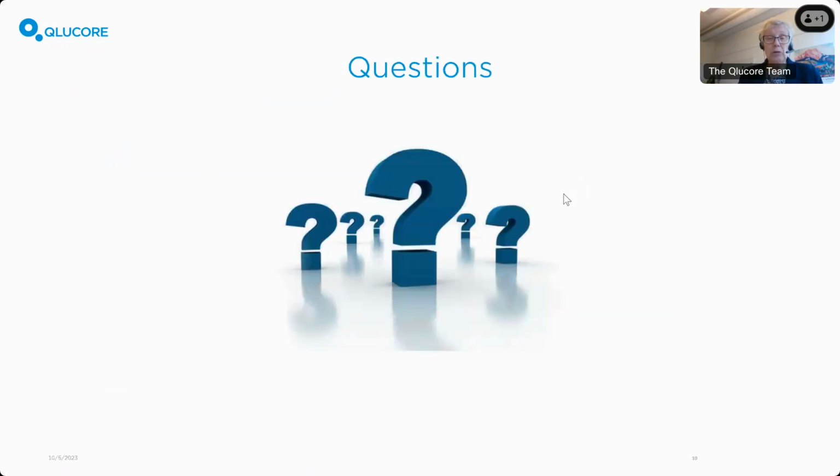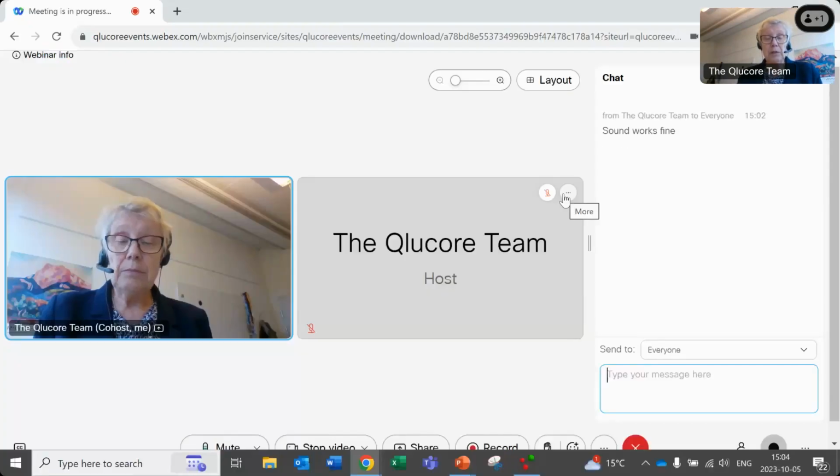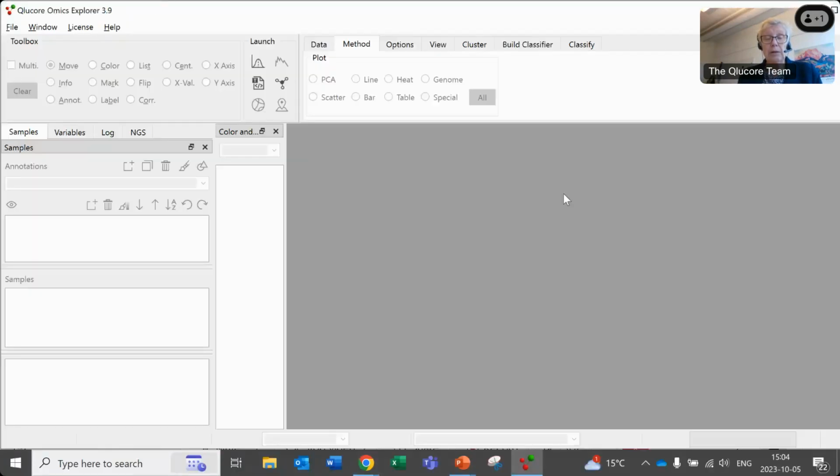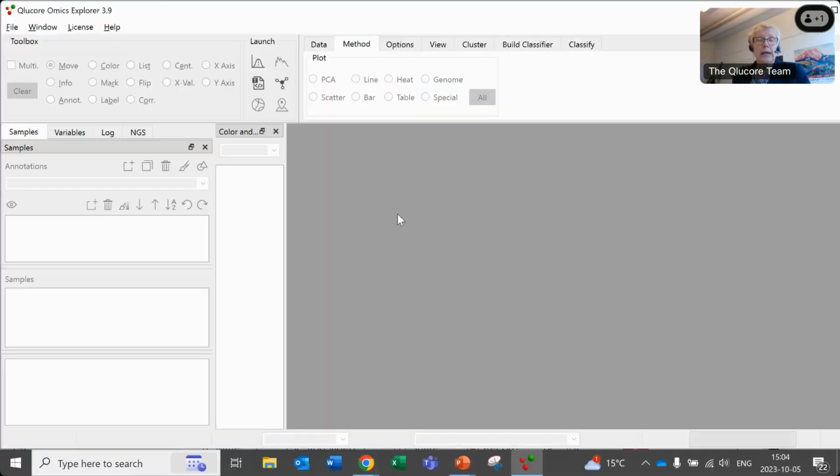Okay, so let me show you how this is done. So I now share the software with you. So let me just check that there are no comments. No. I will share the slides with you after this webinar.